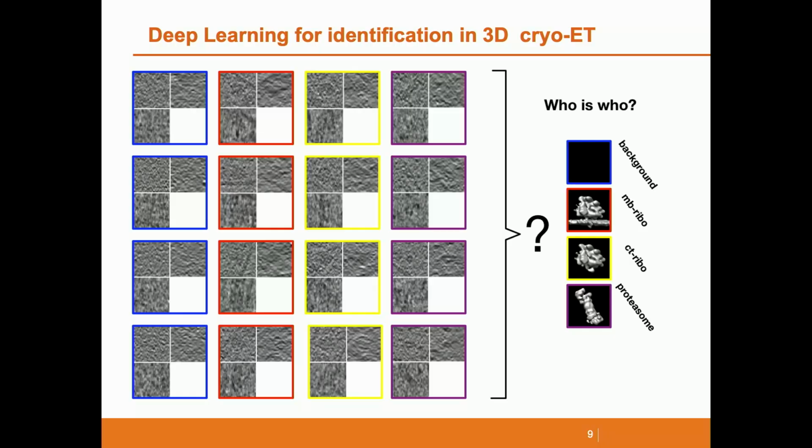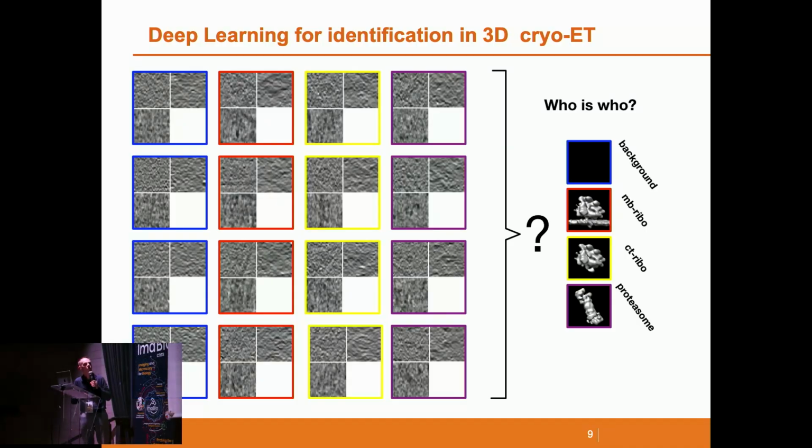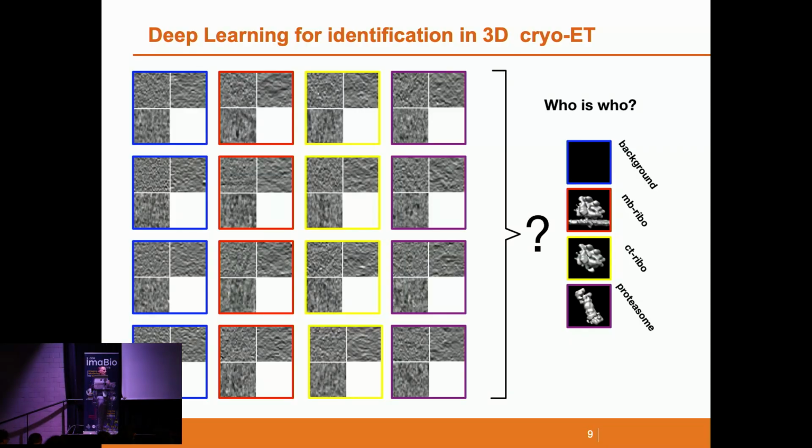Maybe some of you saw my talk a few months ago, but even if you know the solution, it is not easy to do. How can you detect such macromolecules in such complex data? The data are corrupted by a missing wedge, noise, and so on. That's why it's very hard to detect. And as in fluorescence microscopy, you have to reduce the dose of electrons to preserve the specimen as well. That's why you have very noisy images to analyze in that case. So you need experts, and in general, the number of experts is not so high in the literature. So it's not cheap, right?